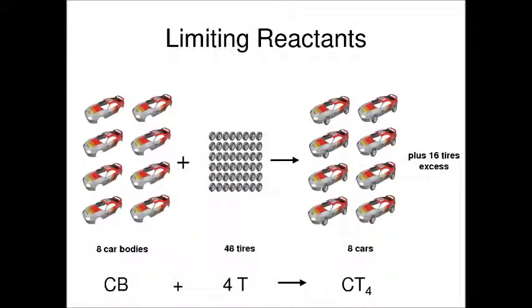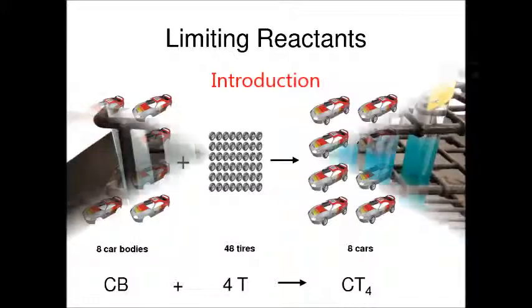A limiting reagent is a reactant in a chemical reaction that limits the amount of product that can be formed. This experiment was designed to determine the reactions between two aqueous solutions, copper sulfate and potassium hydroxide. We also determined the limiting reagent at two different ratios of the two solutions.